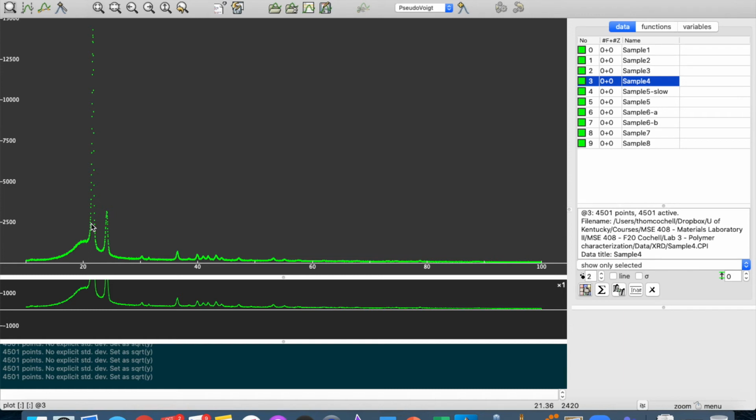And then, based on all of the other information that we get through the course of this lab, so mechanical properties, density, DSC measurements, all of those properties are going to give us a shorter list of polymers that our samples could be. And then we're going to have to go and find patterns for those proposed materials and do a one-to-one comparison to those materials.